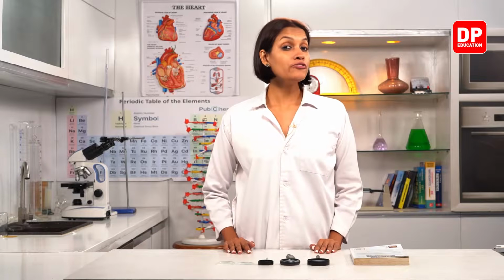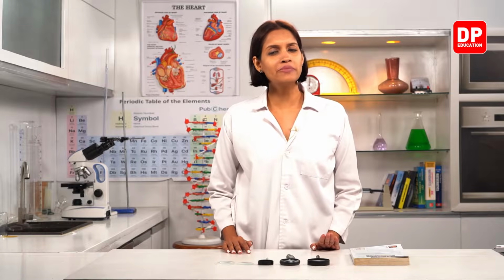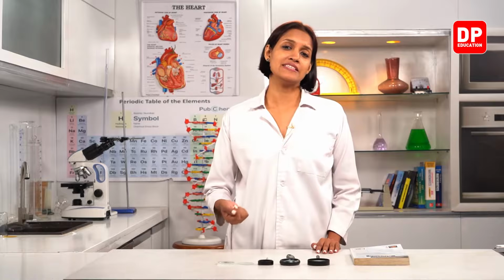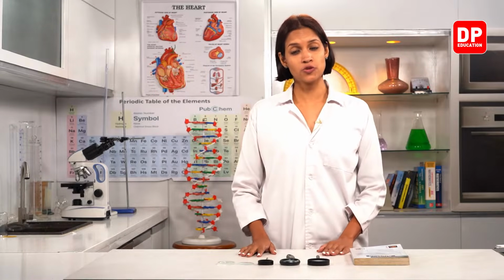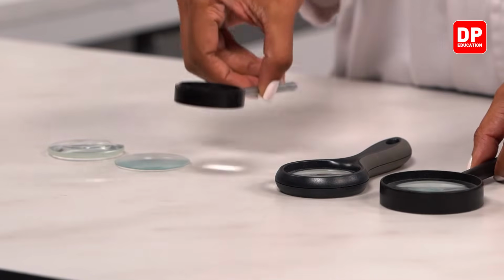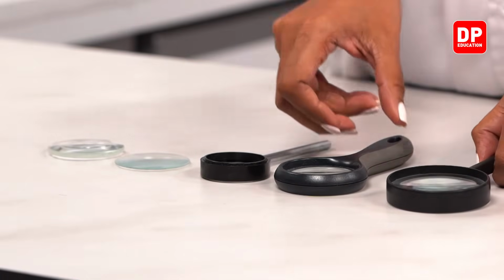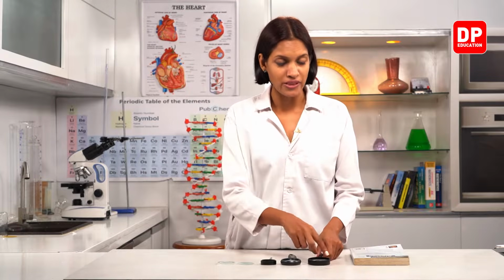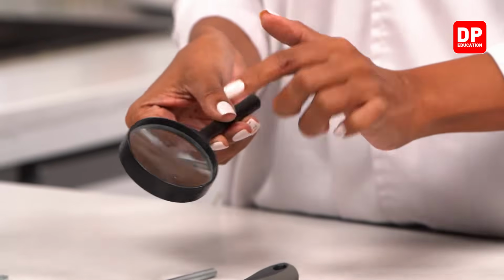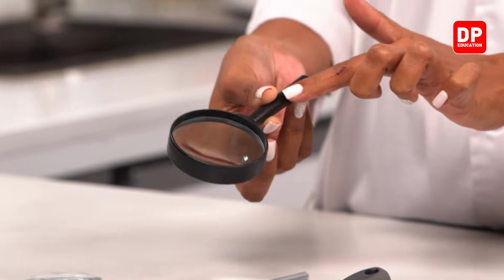Right, children. Now we are going to read small letters using a hand lens. Now you all are familiar with hand lenses. Sometimes we even use hand lenses as toys in certain instances, okay? Right. Here I have different sized hand lenses. Now what is a hand lens, children? Hand lens is a convex lens with a handle and a frame. Now look at this one. This is the lens part. This is the frame. This is the handle.